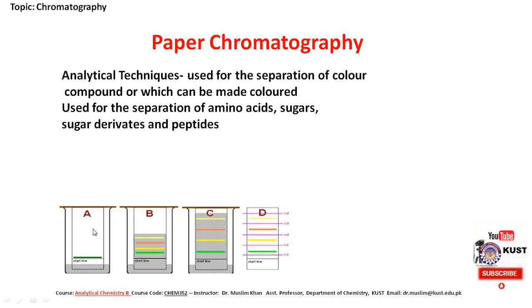through capillary action, and dissolves this sample mixture, and then this is going through this stationary phase. In this, the different components present in the mixture, so here in this picture you can see these different colors considered different components of the mixture, develop different types of interaction with the mobile phase as well as with the stationary phase. And these different components are basically moving through this stationary phase. As the interaction for these different components is different, they are separated on the basis of these different interactions with the mobile phase and with the stationary phase.